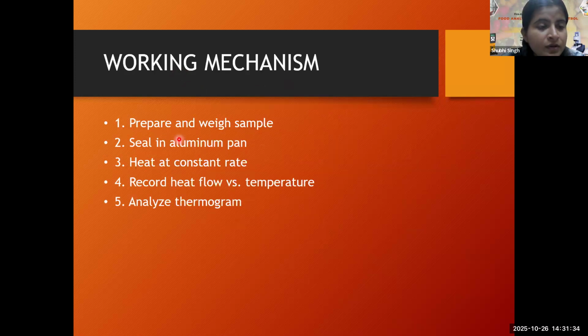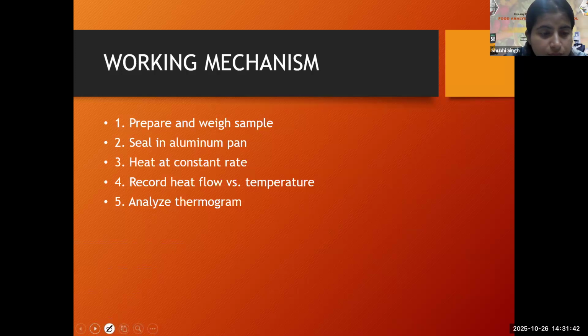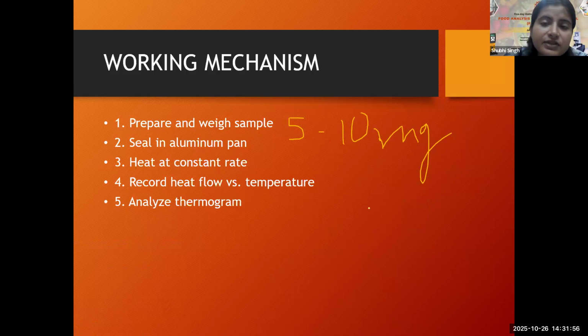So 5 to 10 mg is taken, and we seal it with the help of an aluminum pan, which we have already discussed.